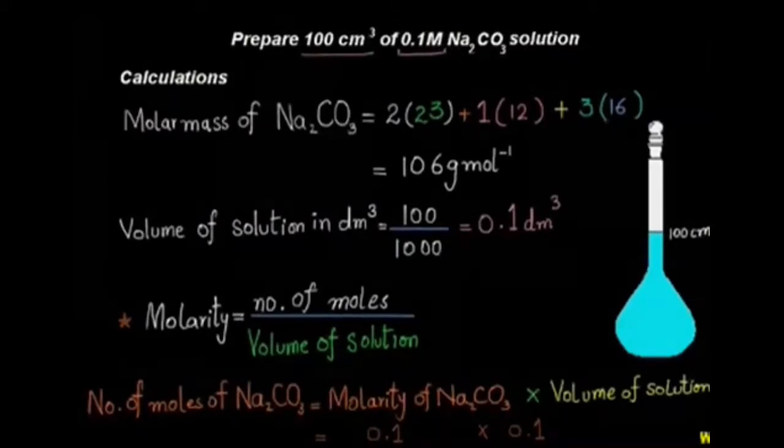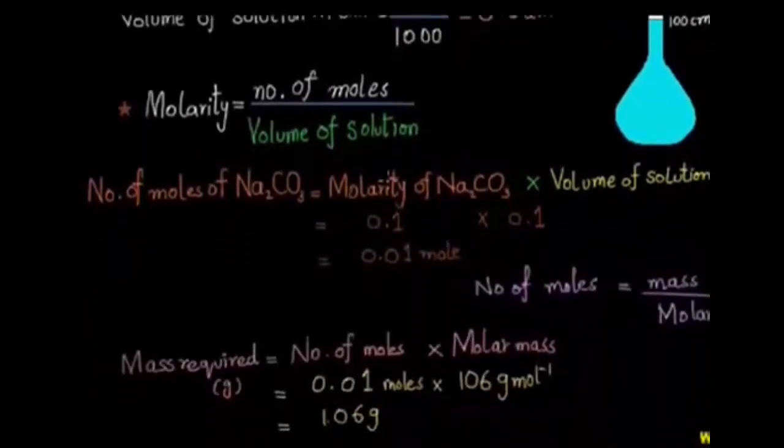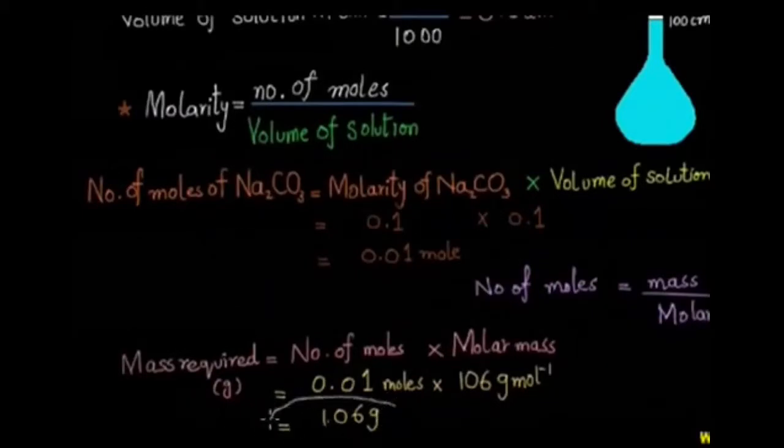So these were the early calculations required to prepare 0.1 molar sodium carbonate solution in 100 centimeter cube. After these calculations, we find that 1.06 grams of sodium carbonate will be required to prepare its 0.1 molar solution. Remember the formulas.